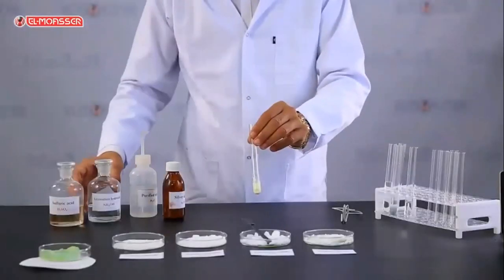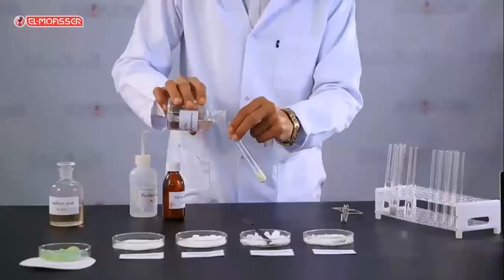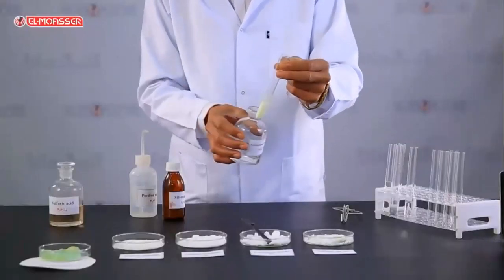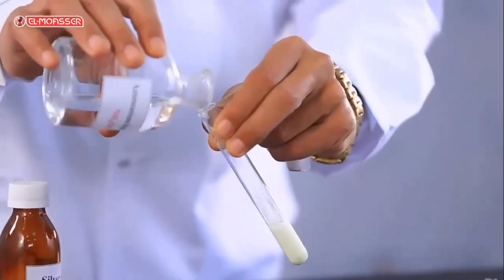Add a concentrated ammonia solution to the precipitate. What do you observe? The yellow precipitate is insoluble in ammonia solution.